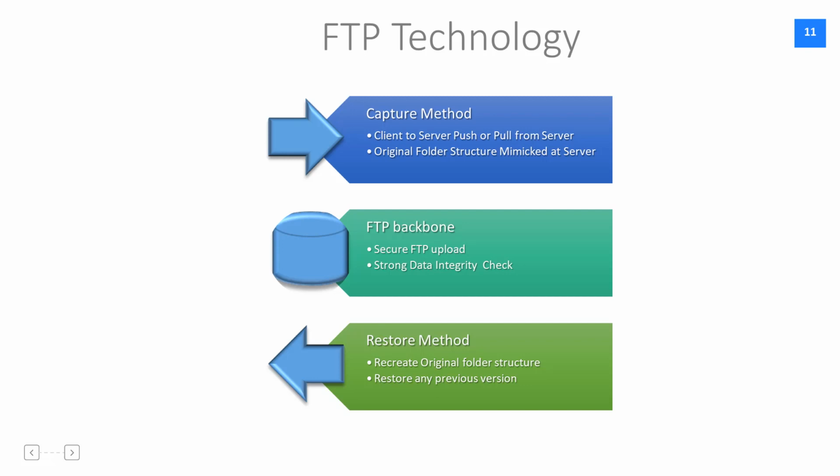Logilab SDMS services can run on the server and pull data from the XP machine or a Linux machine into the server. The push mechanism works in a way where Logilab SDMS upload services are installed in respective client PCs, which are monitoring the instrument generated data, and once they find the data, they push the data from the instrument side to the server. This means Logilab is very unique where you will be able to do push and pull data generated by the instruments.